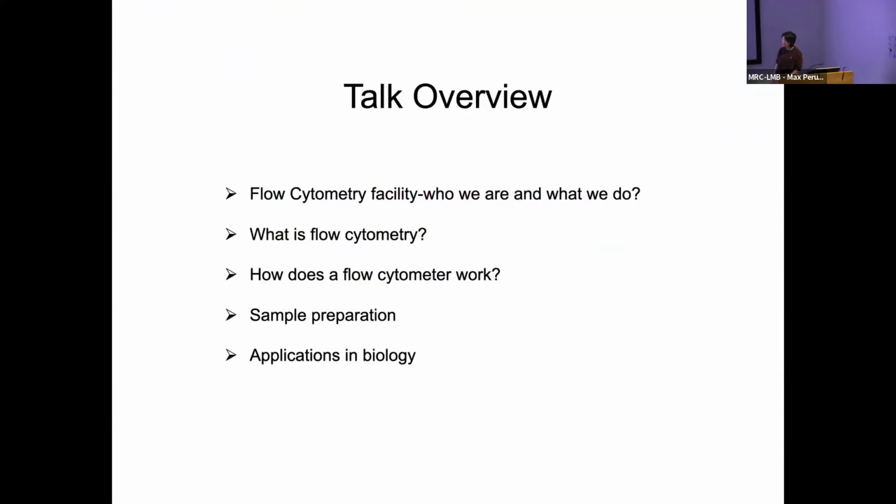So I'm going to talk through our flow cytometry facility, who we are and what we do. What is flow cytometry, how a flow cytometer works, followed by sample preparation, and most interestingly, probably useful, to show you applications we have done in our facility.